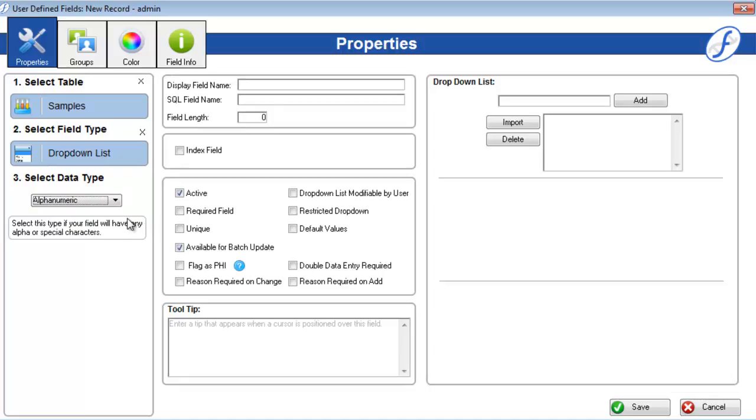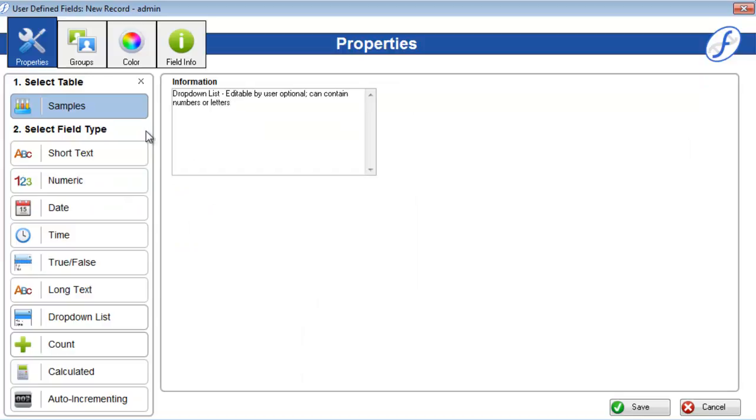Now we have a Samples drop-down list field of alphanumeric data type. You can change your selections made in these first three steps prior to saving the new field. Once the field is saved, however, its table, field type, and data type will all be locked from further changes.